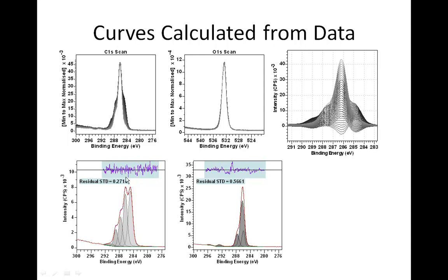The key point about these calculated spectra is that one looks very similar to what you would expect for sucrose in its raw state, and the other one, less obvious what it is, but nevertheless it has a classical shape that can be fitted with bell-shaped curves. So these both need explanation. One is easy to explain, the other is less easy to explain, but they both together are capable of reproducing what you see here in the carbon 1s spectra over the entire set of 101 measurements.